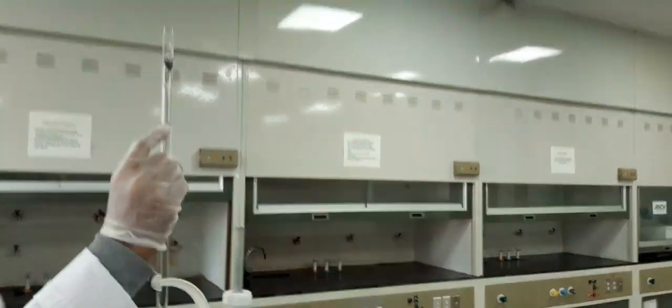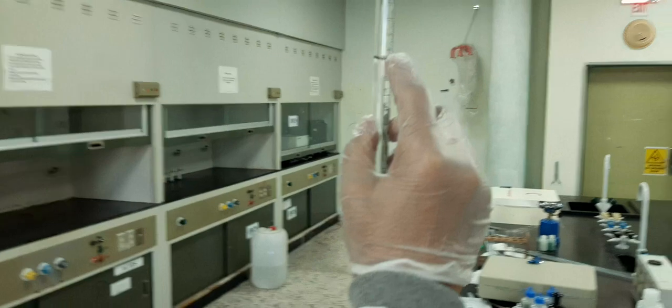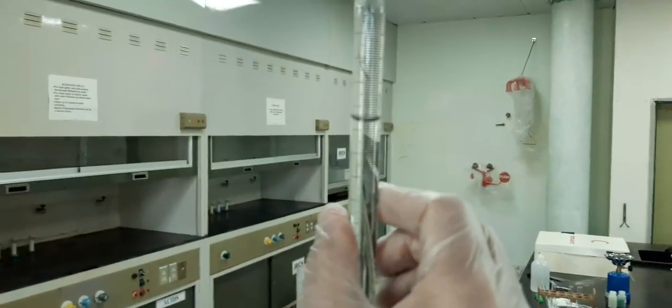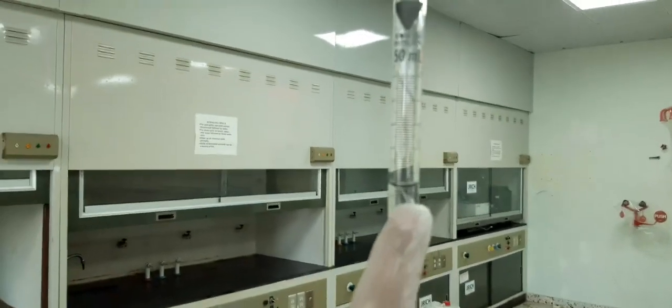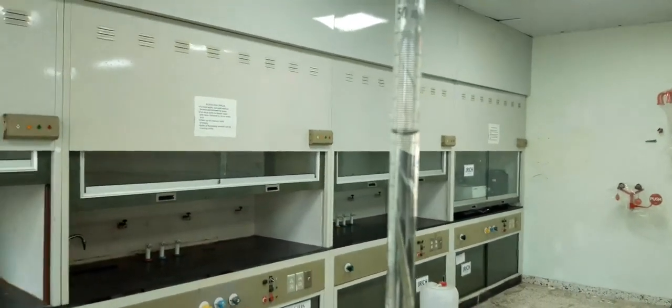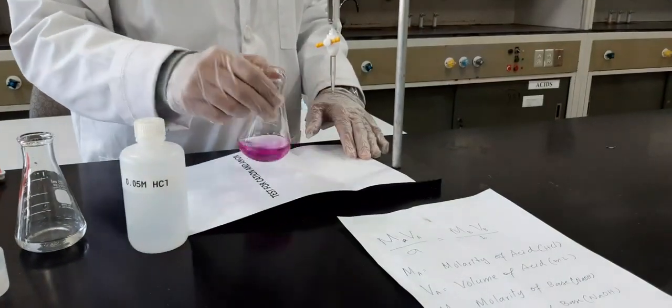We'll find the volume here. How much volume is there? It is around 4.5, it is 4.4 or 4.5, or 4.6 I think. Whatever the volume is, this is your volume for the first one. Now you have to remove this one and record the final reading, VF.